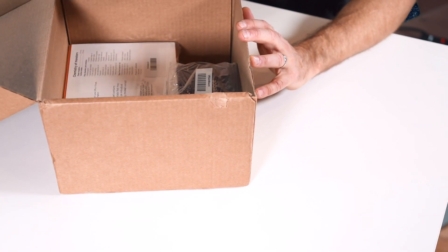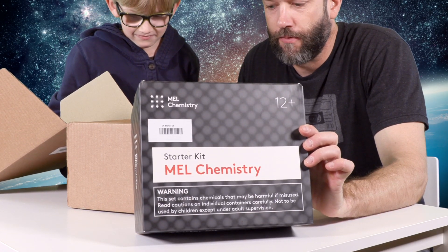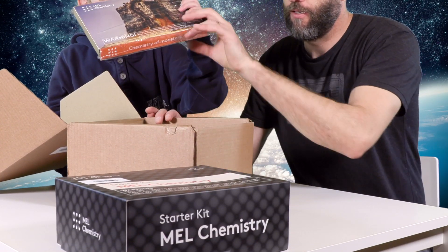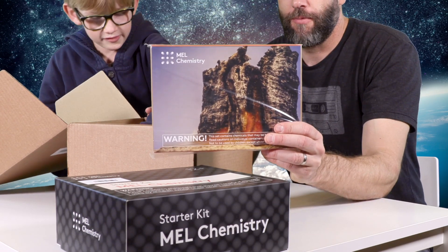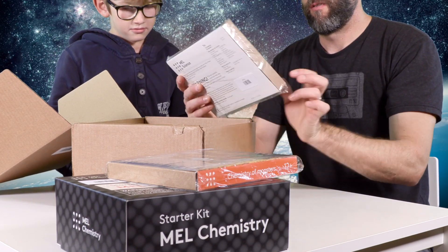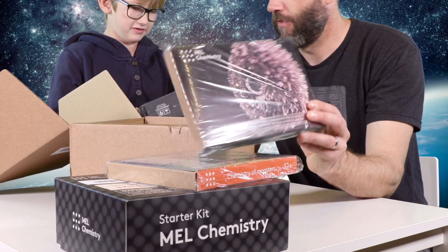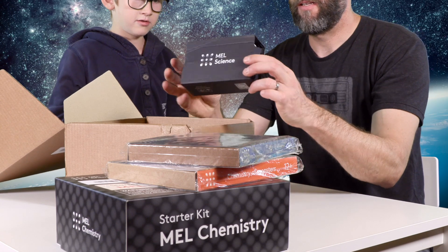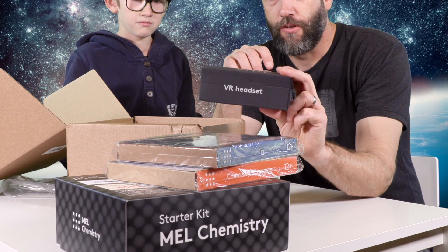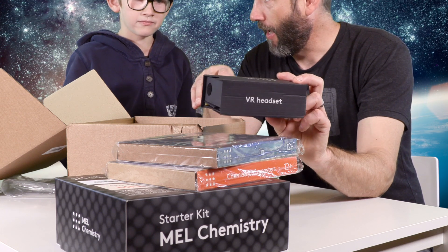First thing — it's a starter kit. This is the starter chemistry kit. Also in the box is Chemistry of Monsters, and Chemistry of Tin. And they also sent us a VR headset, so that you can interact with the mobile app — the iPhone app that they have, which I have downloaded.